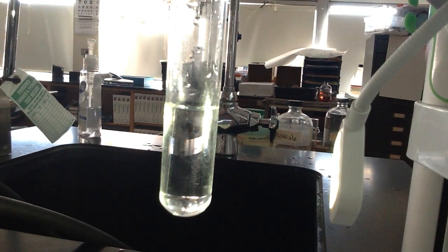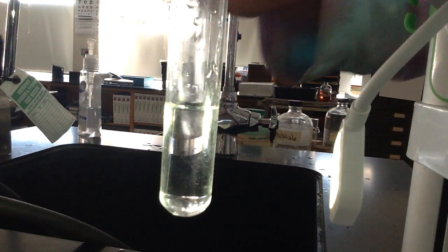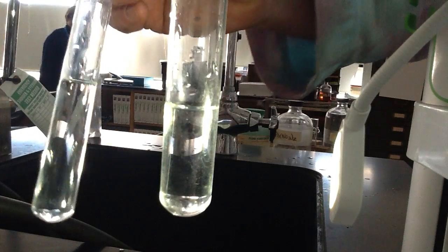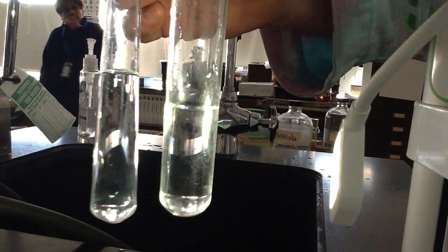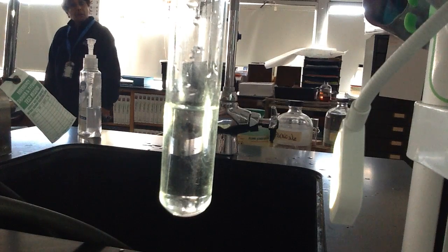So in the test tube is lead 2 nitrate, it's a clear colorless solution, and in this test tube right here is potassium iodide, which is also a clear colorless solution.